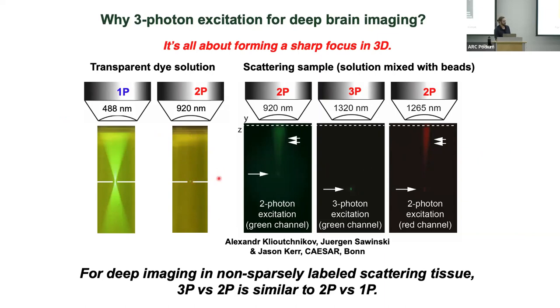You can increase the laser intensity, assuming that you have the overhead power. You can continue to increase that to the point where you do get ballistic photons and you generate signal. However, you'll start to generate fluorescence in this region as well. And that's what's represented in this picture right here. So you start to corrupt your signal.